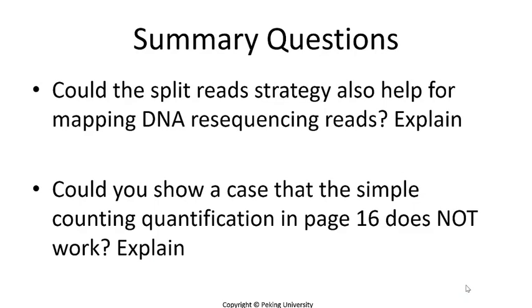Good. Starting from RNA-Seq read mapping, we have made a brief introduction of methods for transcript assembly and expression level estimation based on RNA-Seq data. You can check more technical details in the computer lab video course in this unit presented by Mei Hou and Feng Tian, two students from the Center for Bioinformatics, Peking University.